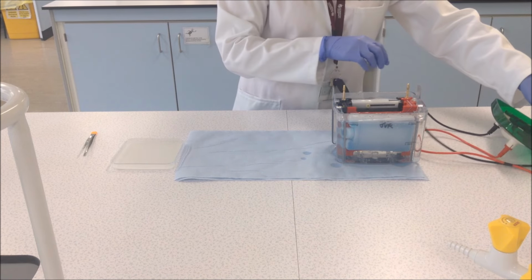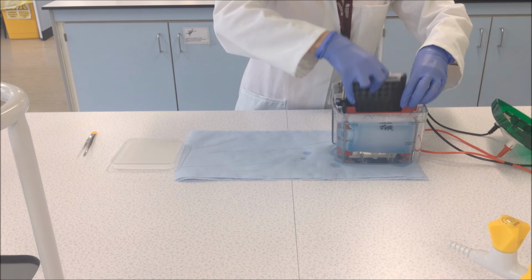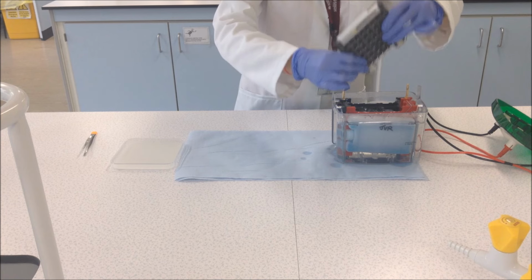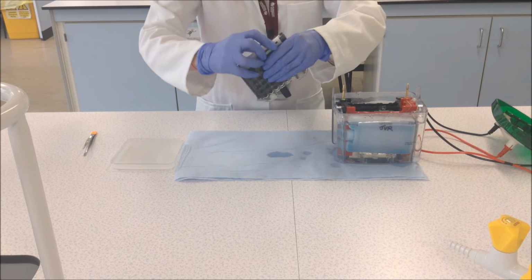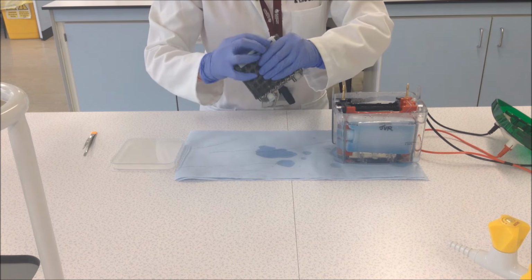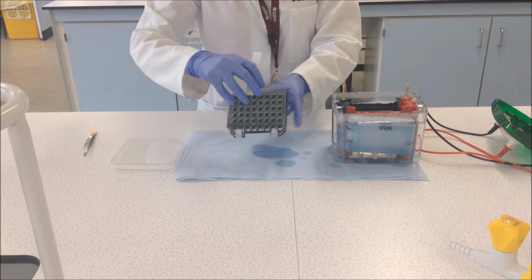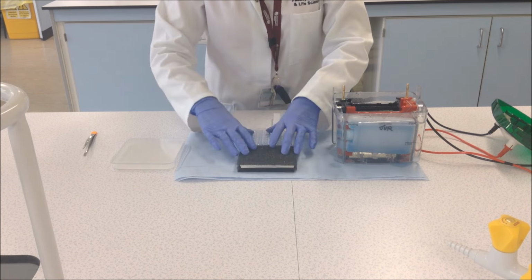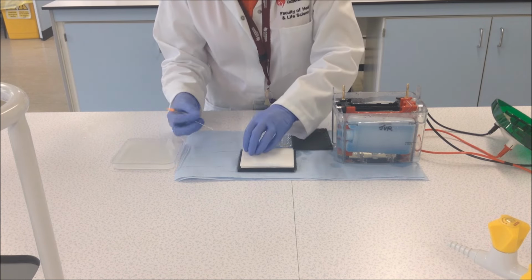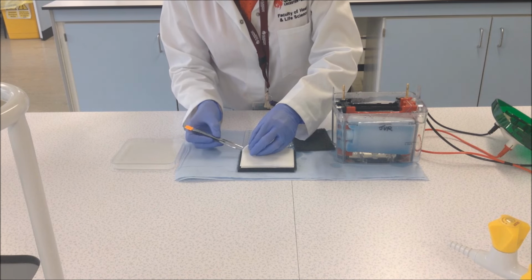Once the transfer process is complete, you can then remove the lid and then remove the blotting module. If need be, you can squeeze the module to remove any excess transfer buffer. You must then carefully unclip the module. You can then place the module down, ensuring that the black side is on the bottom. You can then remove each individual layer until you reach your nitrocellulose membrane.